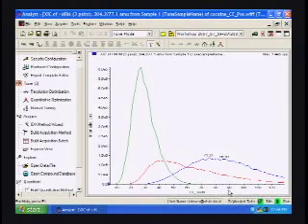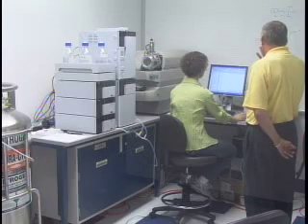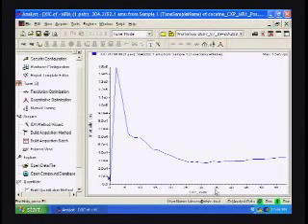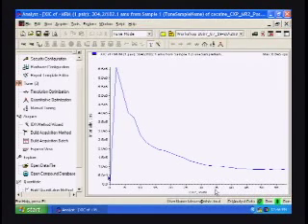It's almost done. I never realized it took this long. Yes.